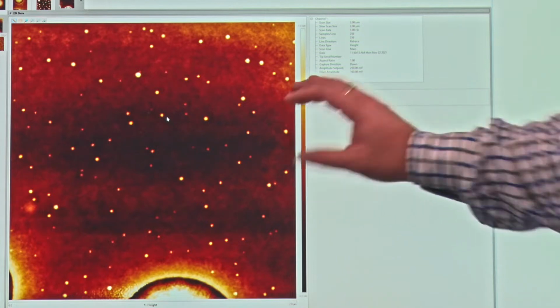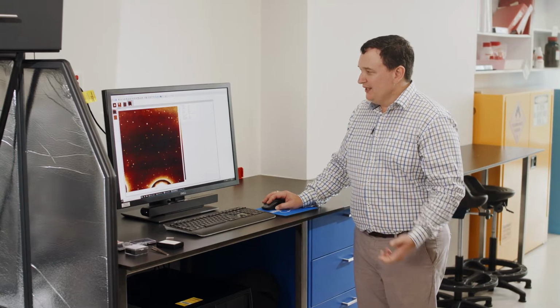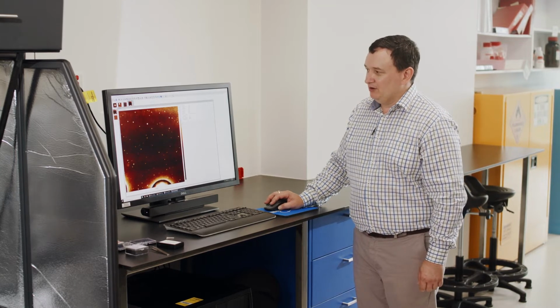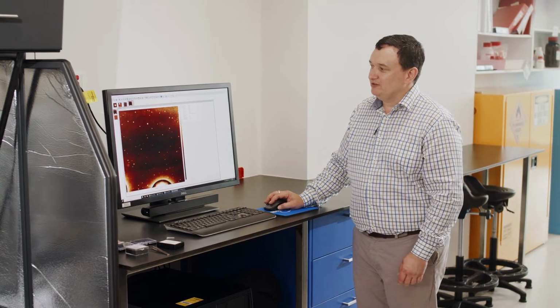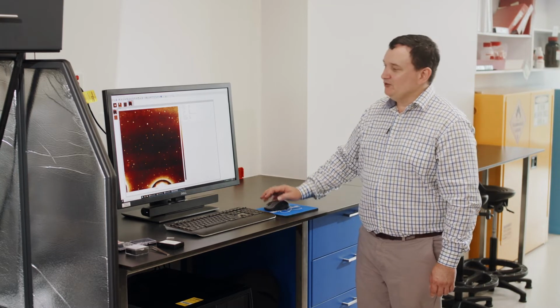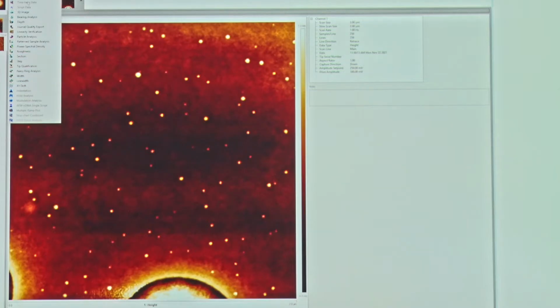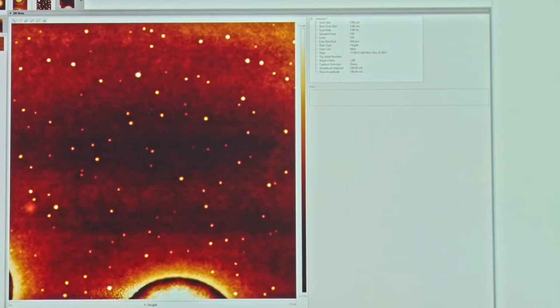Within the Nanoscope analysis software, we have some basic functions such as data manipulation, like flattening of the imaging, or exporting of the data, or taking cross sections and slices, rendering it in 2 dimensions or 3 dimensions. And we have those in command format from the drop-down window here under analyses that we can do, or we have them as icons also across the top bar here.